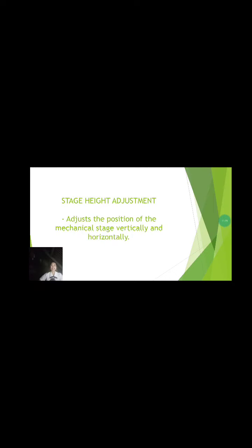So, it is important. Nganong important man siya? Because mo-adjust man siya sa objective lens so that it is never coming into contact with the slide or specimen on the stage.